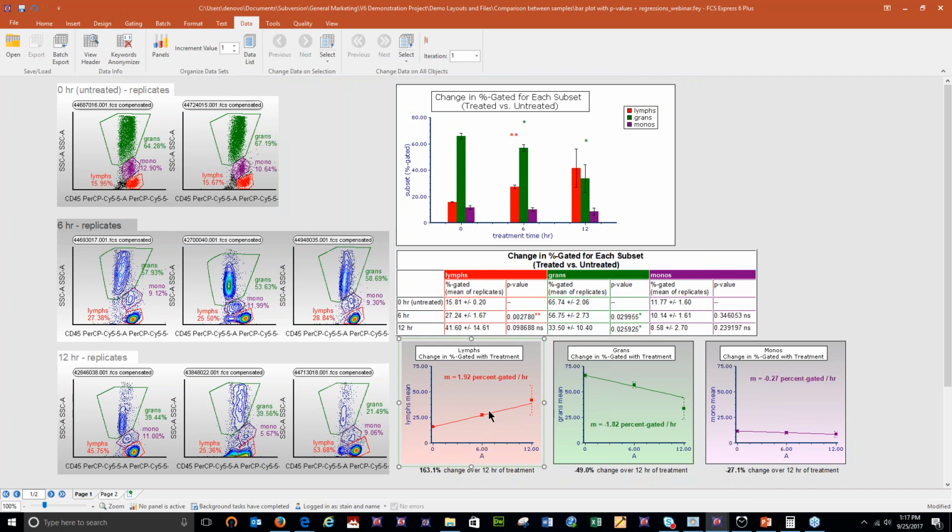Okay, so let's get started. So you're probably thinking this is all well and good, but what does this actually do for you? So the key advantage here is that once you build your template, you can load your data over and over into it every time you do a repetition of the same experiment, and your bar plots and p-values and everything will auto-calculate.